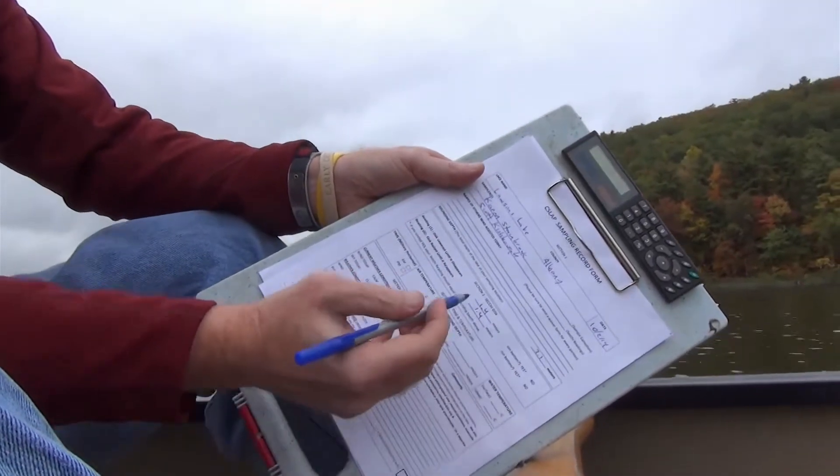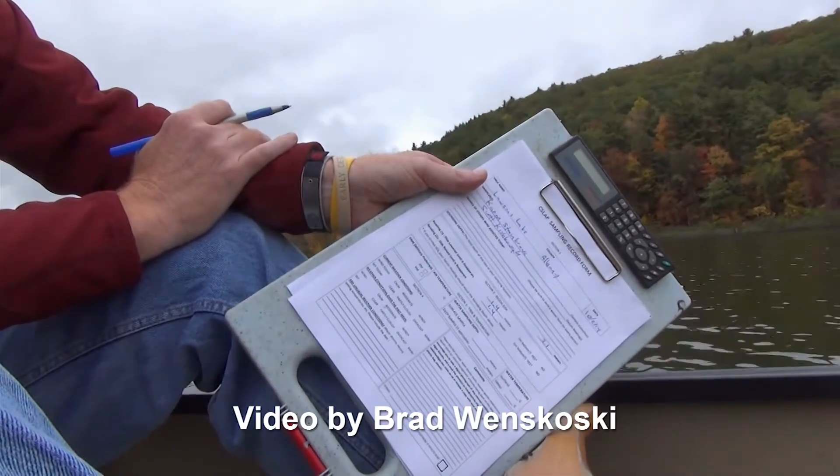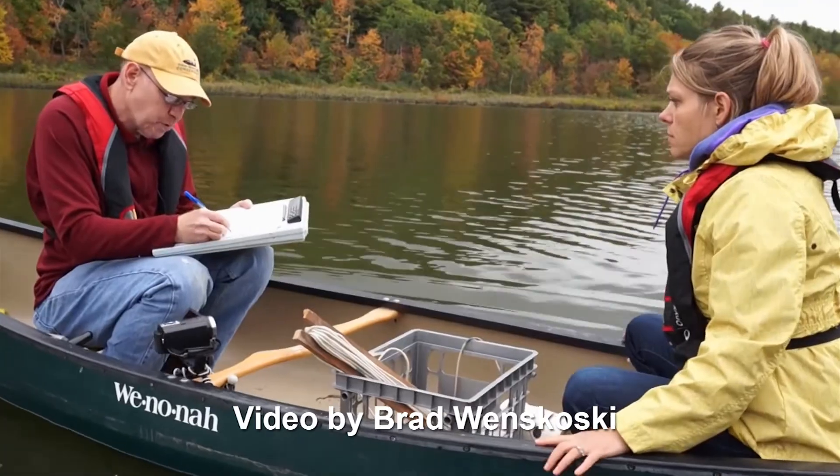The only other thing we need to note on the form is whether the disc is sitting on the bottom when you're actually looking at it. That wasn't the case here, so we'll circle no for both of those.